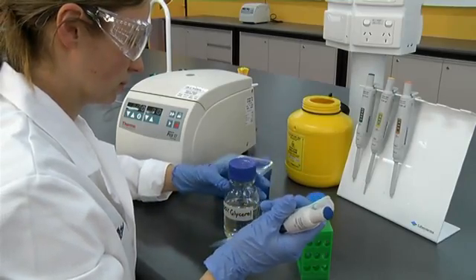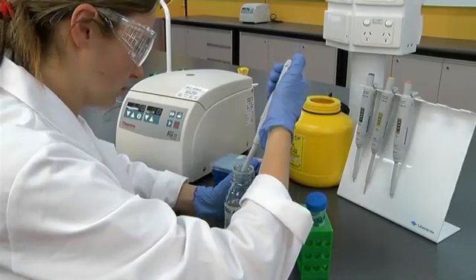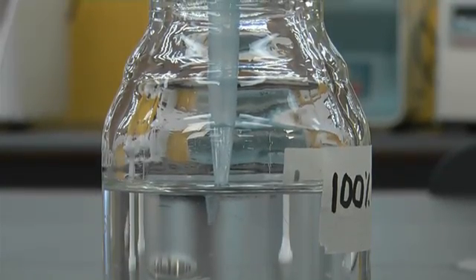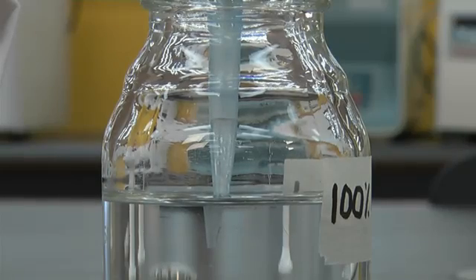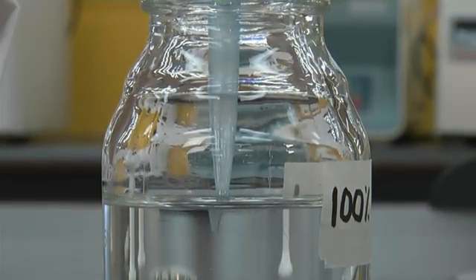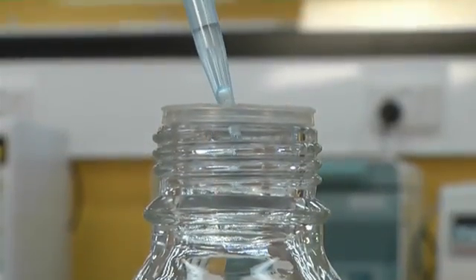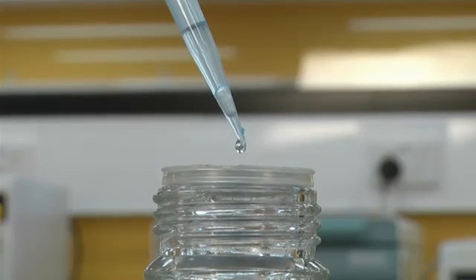You will often have to pipette small volumes of viscous solutions, like glycerol or detergents. These can pose some problems to pipette accurately, as viscous solutions enter the tip slowly and can adhere to the outside of the tip. They are also very difficult to completely expel from the end of the tip.